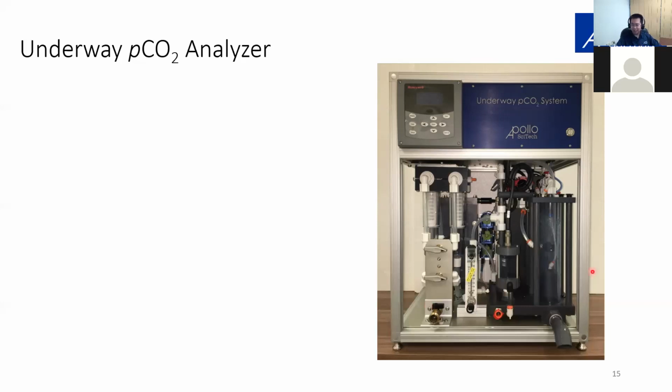I don't think you can see that in this picture clearly, but there's another equilibrator behind this one. The secondary equilibrator is designed to remove the bias introduced by the atmosphere. This whole design is based on an improved design from NOAA.